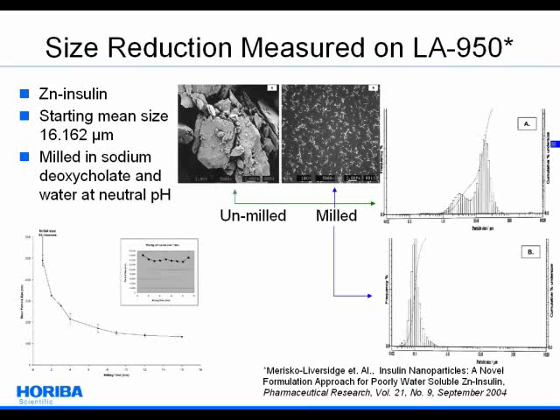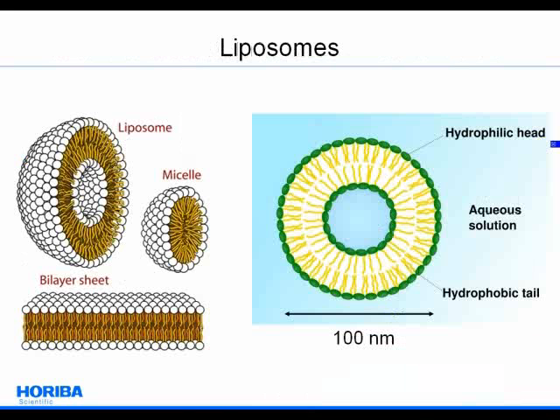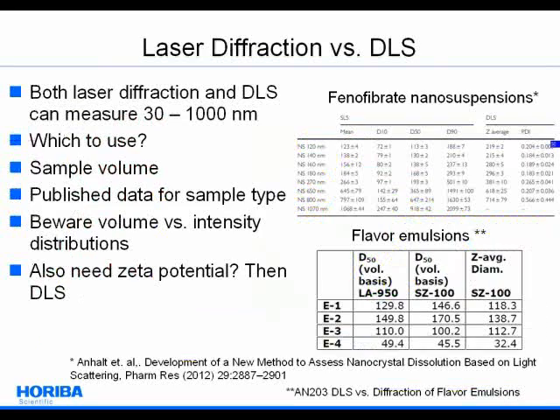All right, so we were talking about hydrodynamic diameters, laser diffraction versus DLS. And we're talking about some other studies that I've seen where they talk about the difference between laser diffraction and dynamic light scattering. So this is data I found published in Pharmaceutical Research, where people actually published this particular active ingredient, and you see it's on the scale of 180 nanometers, both static light scattering, that's dynamic light scattering. You know it's DLS because it says Z average, and this is static light scattering. That's another name for laser diffraction.